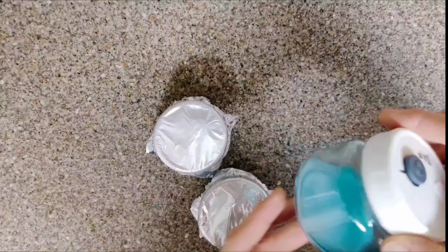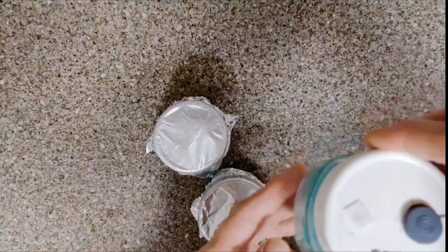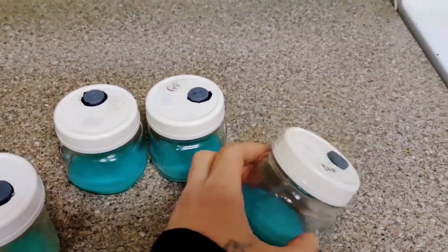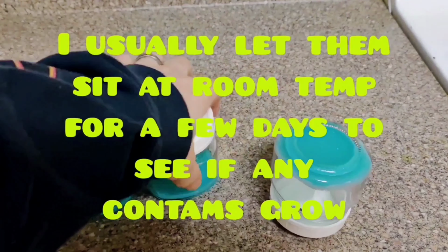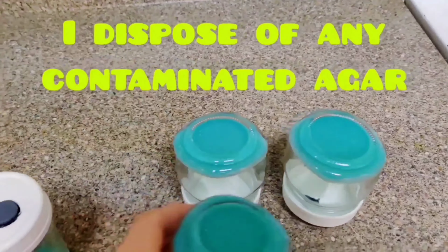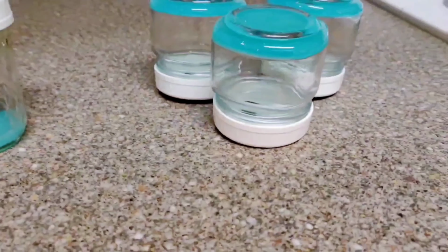Once they have cooled enough to solidify, I store the jars at room temperature for a few days to ensure no contamination shows up. I keep the jars upside down to keep condensation from pooling on the agar. Also, I usually store the jars in the fridge until use.